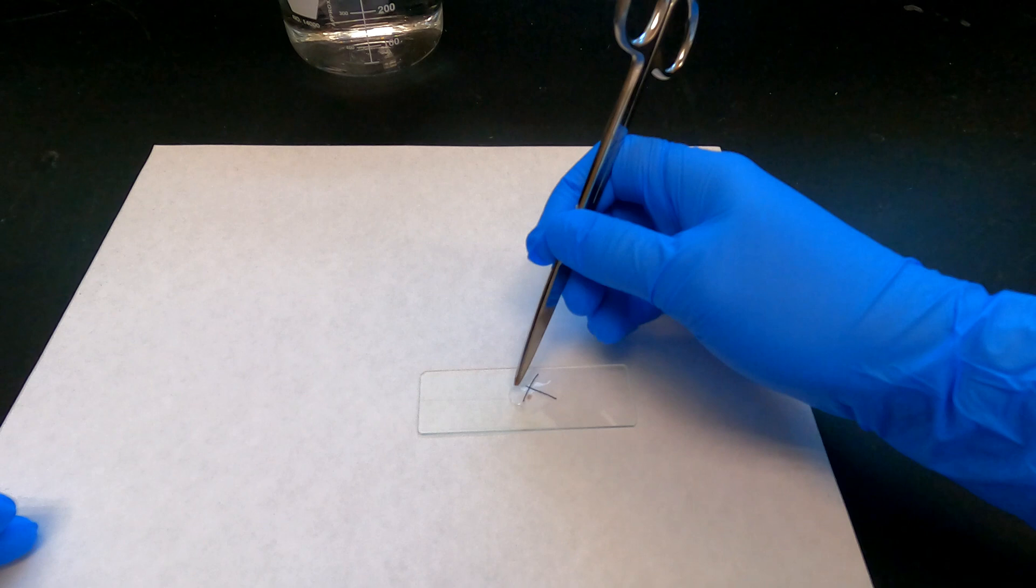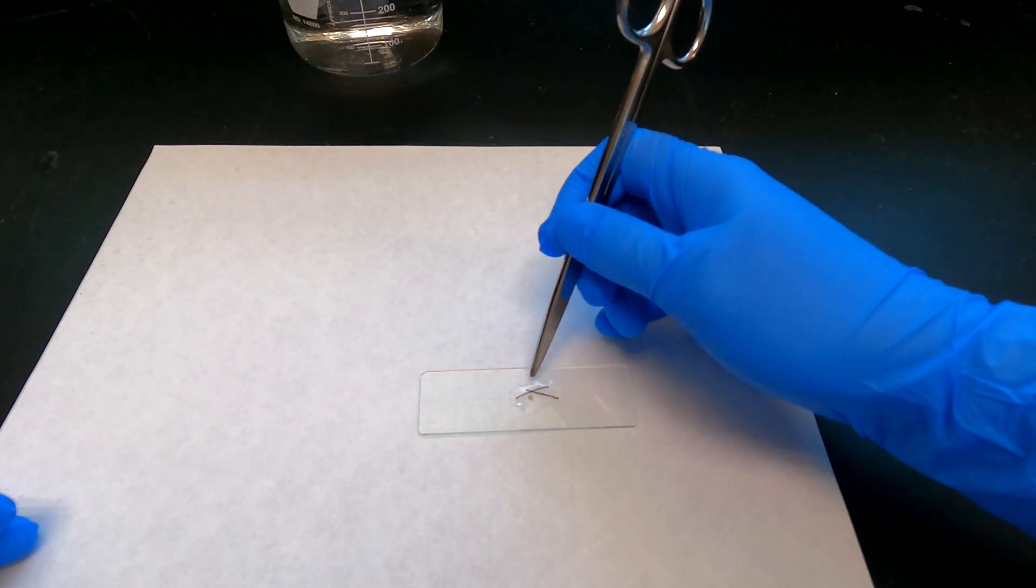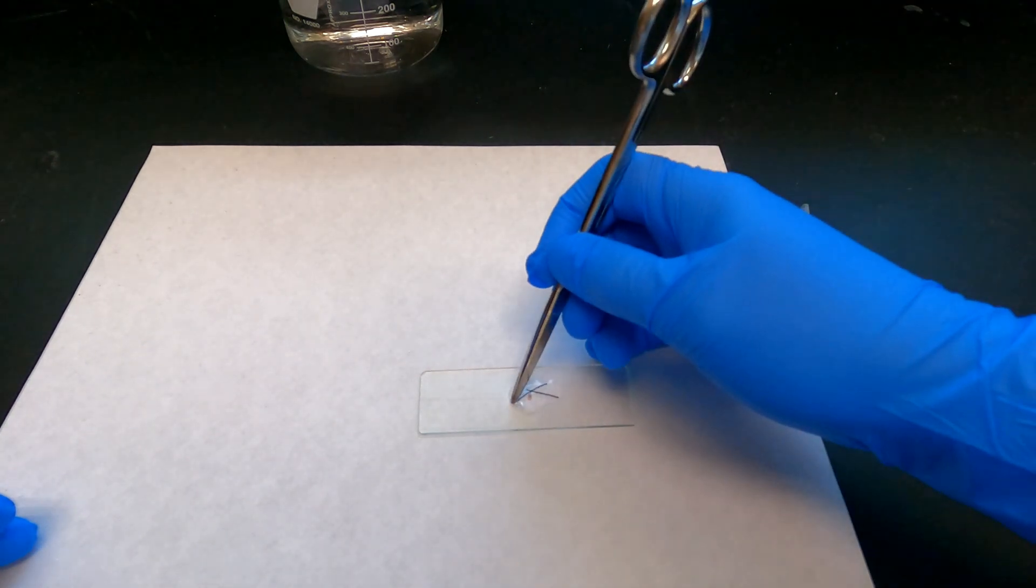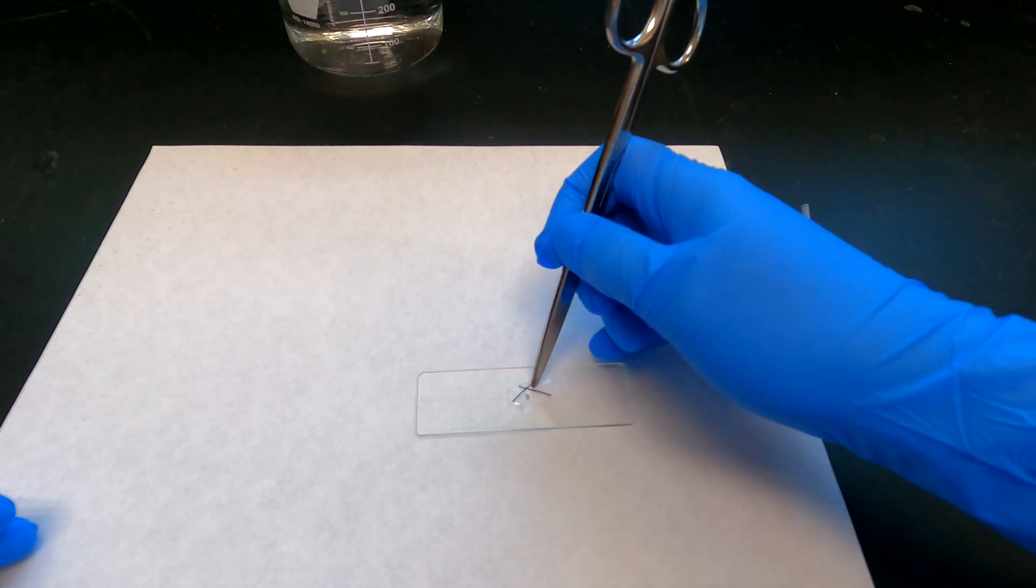You can use a pair of scissors or a micropipette tip to arrange the threads around the Daphnia, making the triangle smaller and smaller to give the Daphnia less and less space to move around.